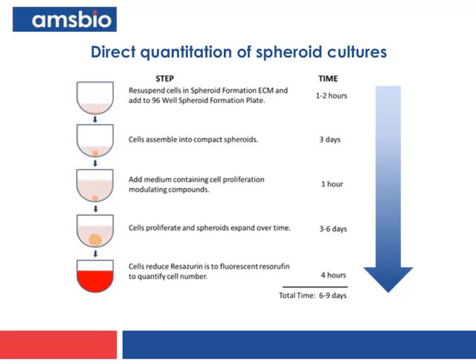That doesn't stop you from imaging the spheroids as they grow. I will show you a demonstration of that in a moment, or doing any microscopy-based approach in parallel to the quantification of proliferation.